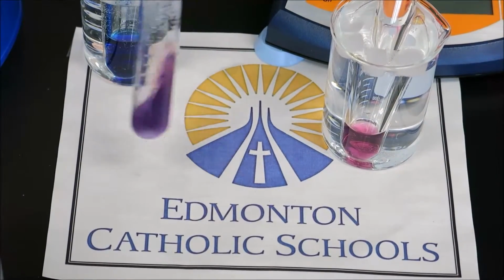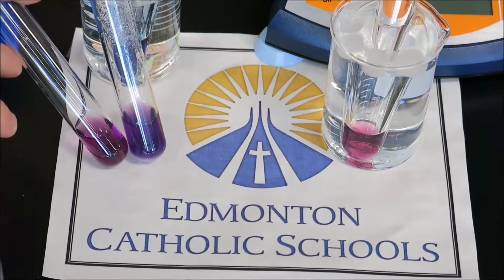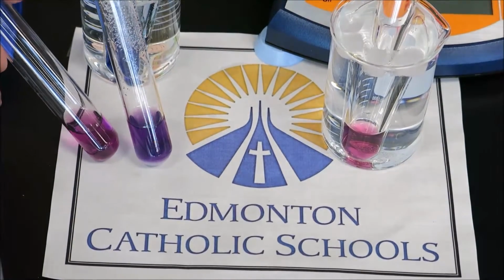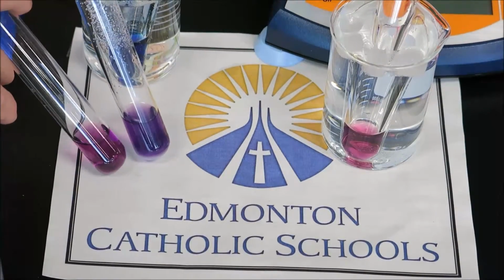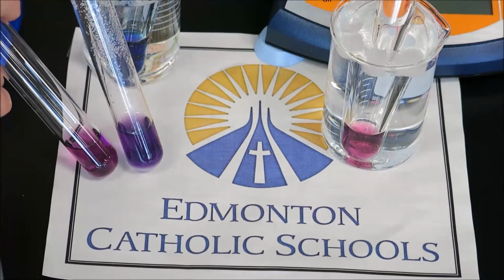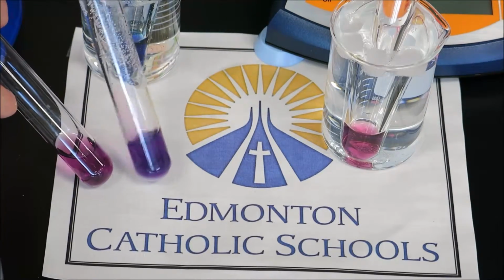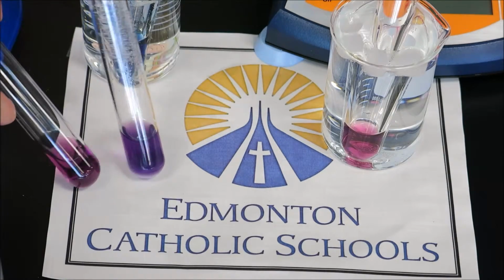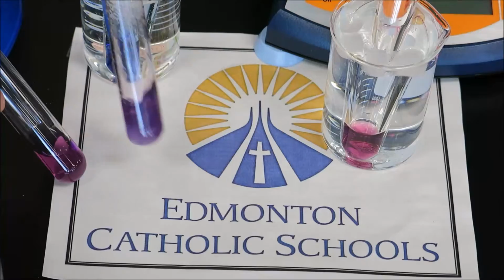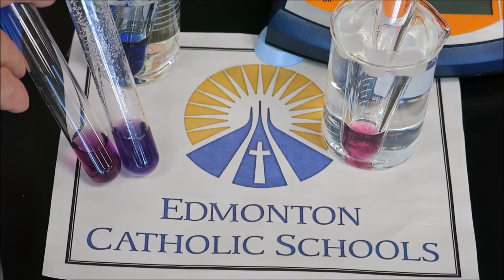And as I agitate it, and then bring again the control, it might not be as obvious, but hopefully we can see that this has indeed shifted, and while still purple, it has become more of a blue purple. So if we want to consider the control more of a mauve, this would be considered more of a violet, more along the blue side of the spectrum. Again, how you describe it is up to you, so long as we can see that this in fact has become less pink and more blue.